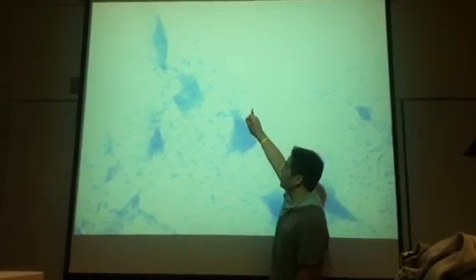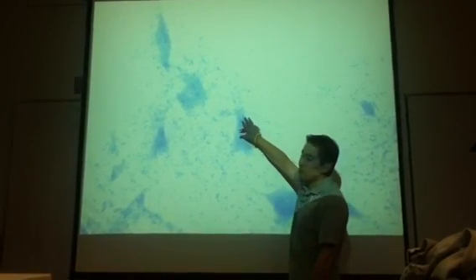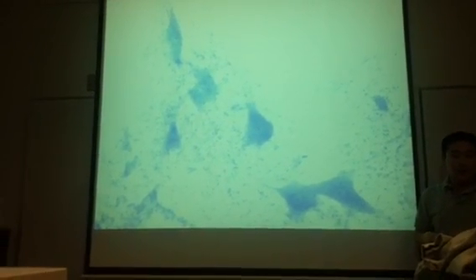We can't really ask you — it's too hard to ask you — what these extensions are, like whether they're dendrites or axons. But if you were to classify these neurons based on their structure, they would be multi-polar. They're all going to be multi-polar, even though some of them look like bipolar or unipolar, because motor neurons are almost always multi-polar.